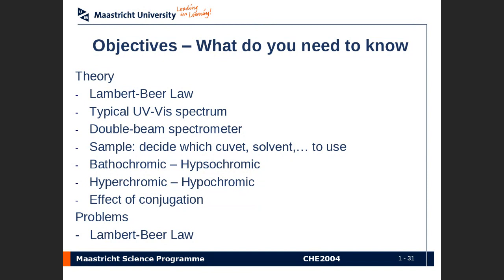We'll have an opportunity to unpack this a little bit more in the flip session, where I want us to have a look at some examples of UV-Vis spectra in practice, and also look at how one would plot this data to find epsilon. So we'll unpack these terms a bit more, and look at it in more detail. Okay.